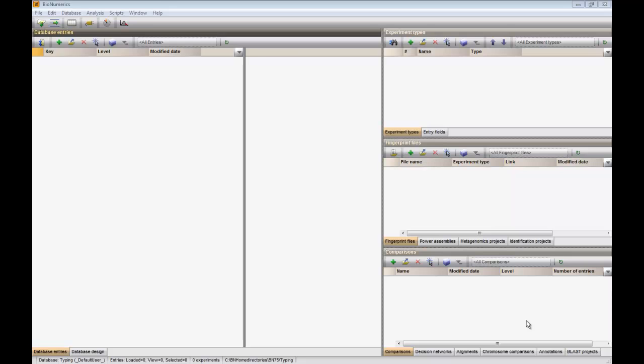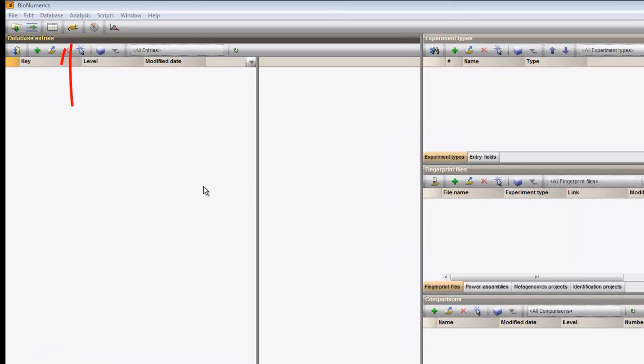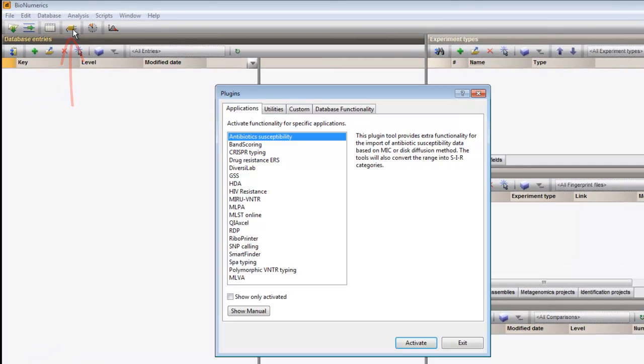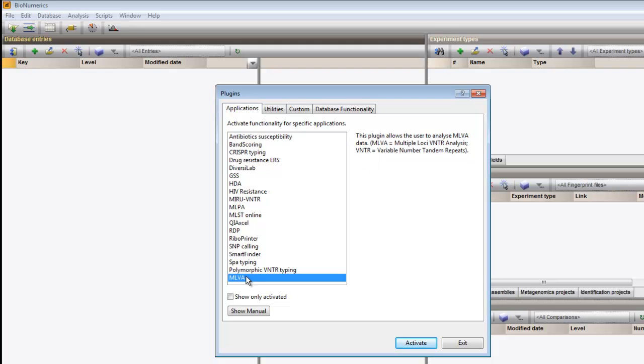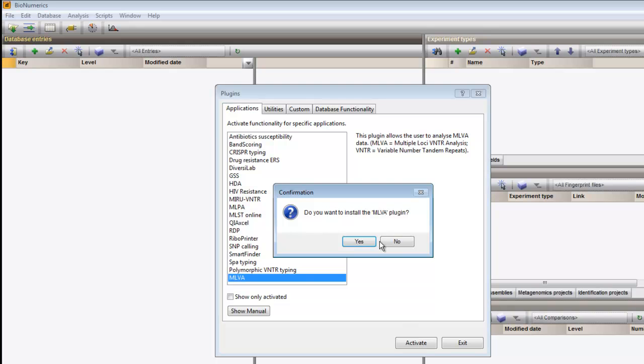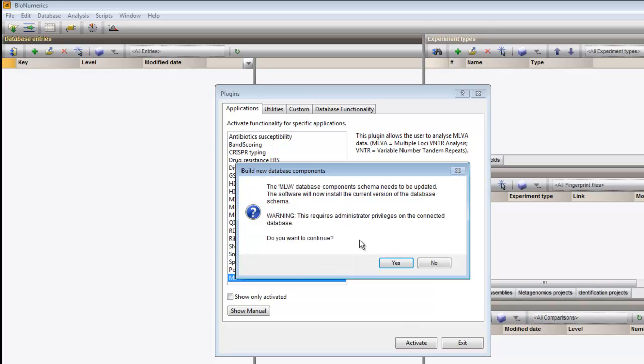We call the plugin dialog box and select the MELVA plugin. Press Activate and confirm the installation. New database components will be added, so you need administrator privileges to continue.